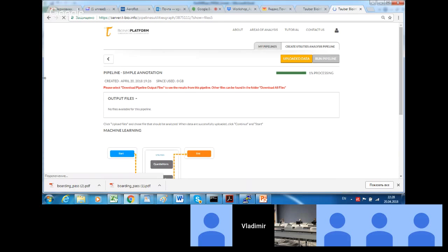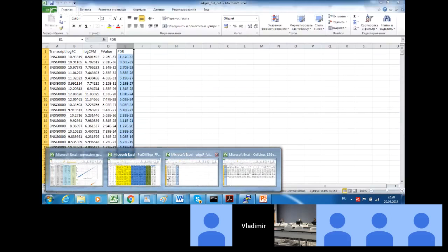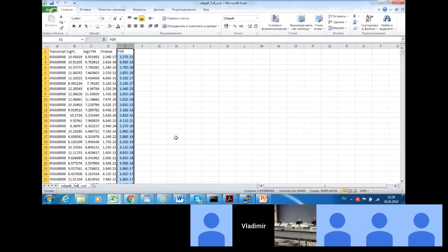So what are the standard steps of further analysis of lists of differentially expressed genes? There are at least two options. The first option is pathway or gene enrichment analysis based simply on the list of gene names.